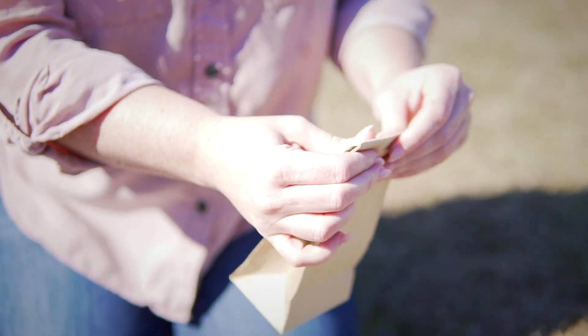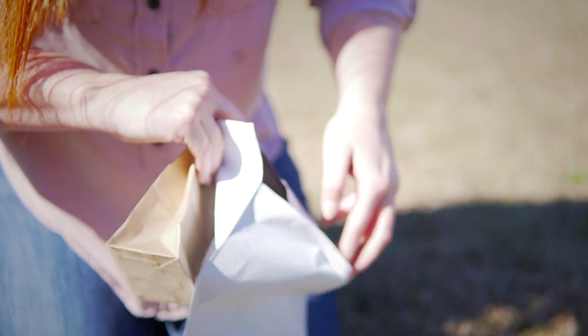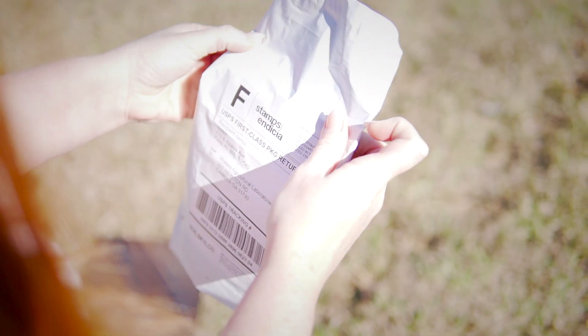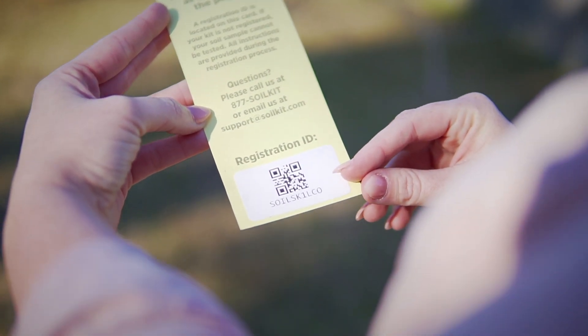Seal the sample bag by bending the tabs. We recommend you write your name on the sample bag. Then put your sample bag into the prepaid mailing envelope, seal the envelope, and send. Be sure to keep your customer care card as it includes your kit ID number for reference.